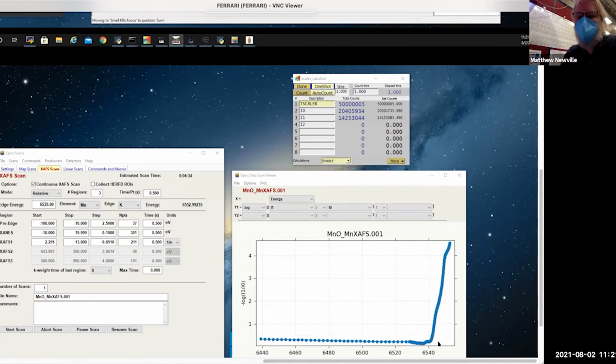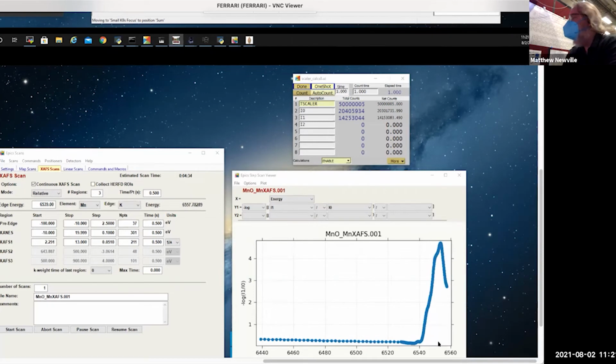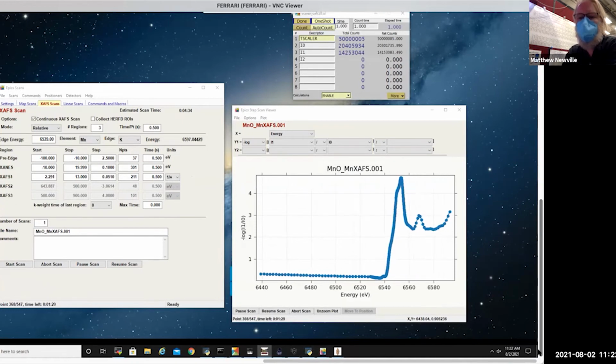It's good to have the foils where some manganese oxide is measured well. It's also fine to measure them someplace else and do energy calibration for these things. Right, and that's looking better for MnO, and it's quite different. We'll read in both of those and just show the difference. I think you all get that already. Maybe I'll go do a scan of a map. Let's go down to the sample and do a map of the sample. I think that's more interesting.